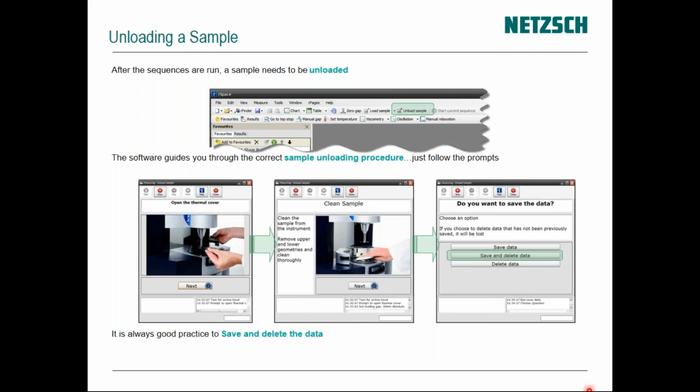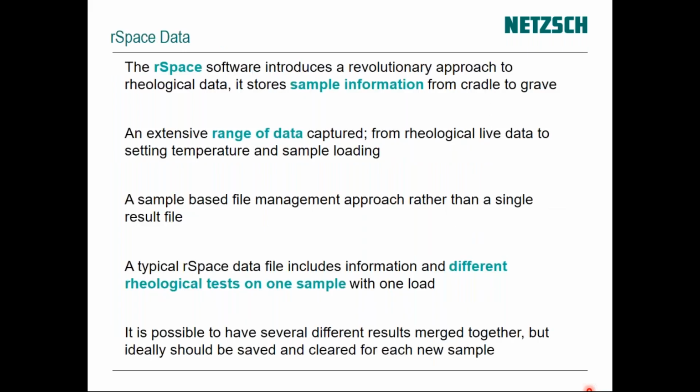So this is pretty easy to use, I've got to say. People usually find it very, very easy to do, and very user-friendly sample and software testing. So there's actually a lot of data captured with the test, and it will load the sample. It will sample and save all the data from loading, the thermal equilibrium time, and then the test results, obviously, and then you can add analyses in there as well, and you can drag and drop data and merge them on. We can analyze them after the test.